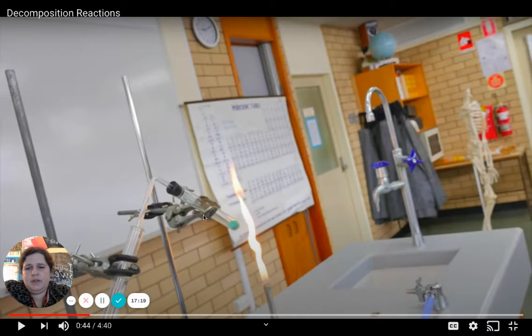These are specific test tube holders for these ring stands, and we use this whenever we don't want to have to be holding the test tube for a long period of time over an open flame, or if we've got some sort of contraption like this set up so that it stays in one place. So he's got that. He's got a Bunsen burner down here. I see a lot of oxygen not going through because it's a big yellow flame. So not very much oxygen going through there.